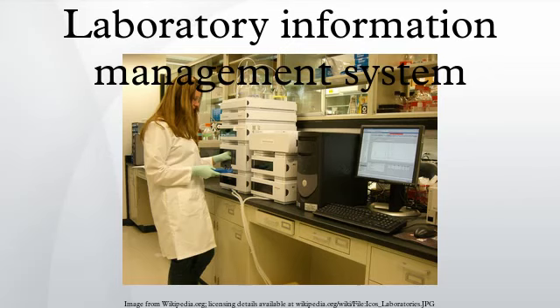In recent times, LIMS functionality has spread even farther beyond its original purpose of sample management. Assay data management, data mining, data analysis, and electronic laboratory notebook integration are all features that have been added to many LIMS, enabling the realization of translational medicine completely within a single software solution. Additionally, the distinction between a LIMS and a LIS is blurred, as many LIMS now also fully support comprehensive case-centric clinical data.